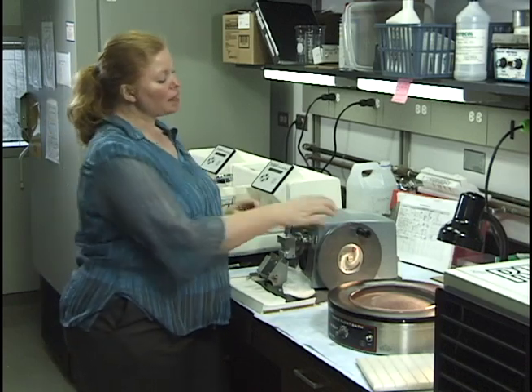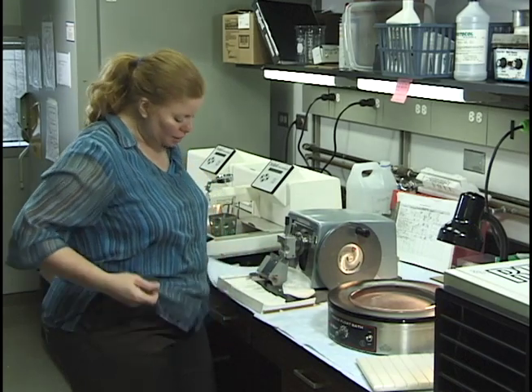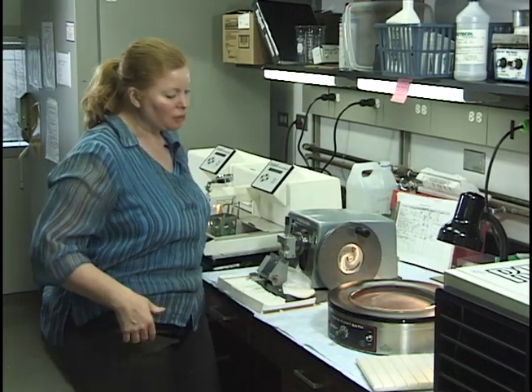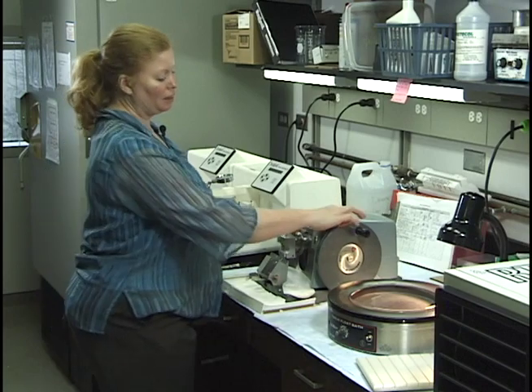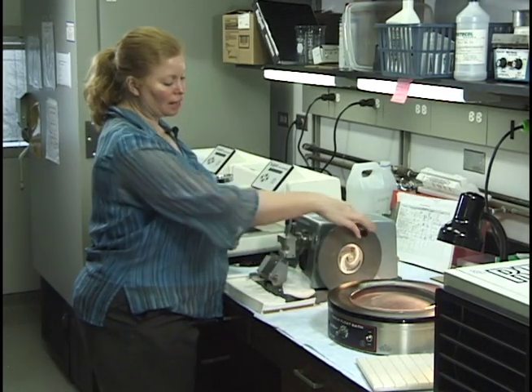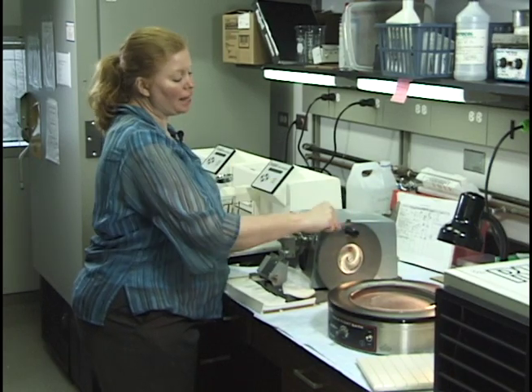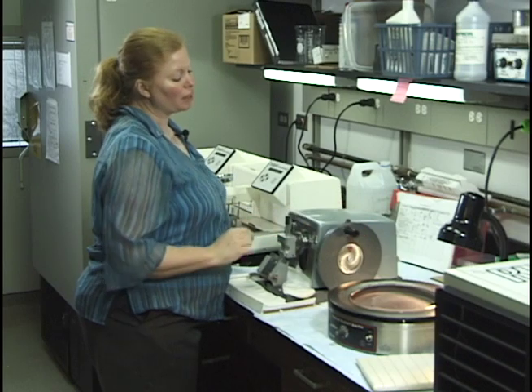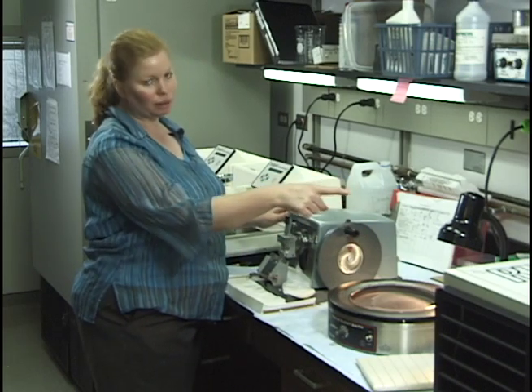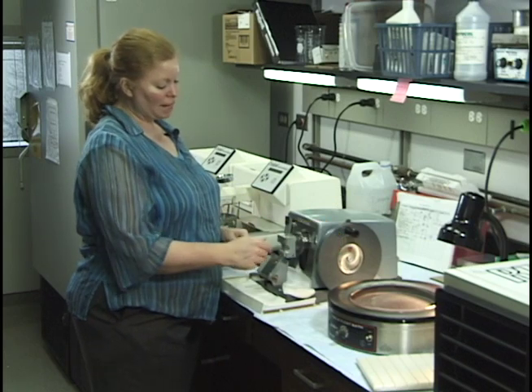This microtome has a locking mechanism. Whenever you change the blade or switch out specimens, I recommend that for safety reasons you use the locking mechanism. That's this here. This is called the flywheel. The locking mechanism is on the flywheel and it's locked. You don't need to yank it. I mean, it's only a little spring holding it. You don't want to break it. That one got broke on the other old microtome. It just prevents it from coming down and cutting your finger.